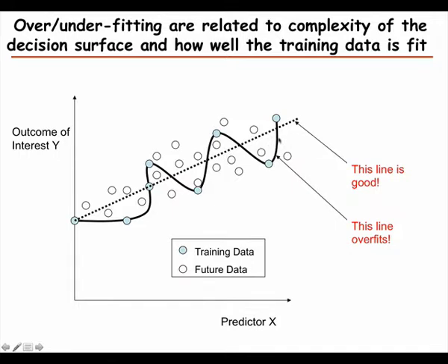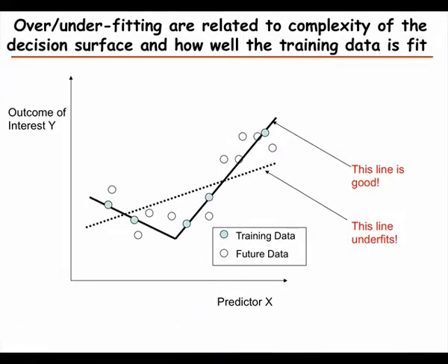But the problem is that it's very difficult to know when we have done an overfitting. And the main reason is that if we have a very large sample set, we can divide it up into training data and testing data and do quite well with that. But usually, since we have few samples, we can't do that really well. So this is just an example of underfitting. So this data seems to be more probably a threshold and then increases. So here in this case, a line would underfit it, but something that goes like that would fit better to the data.